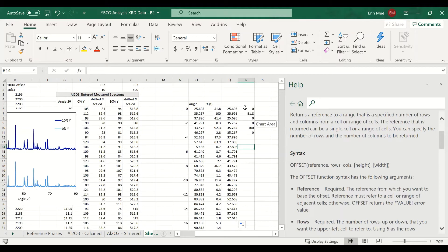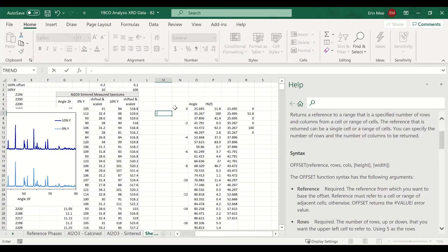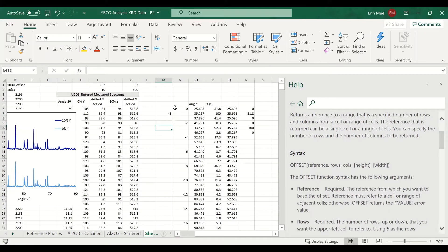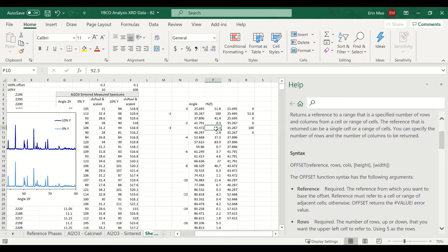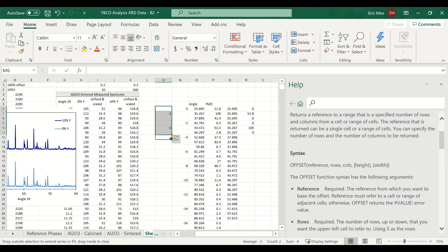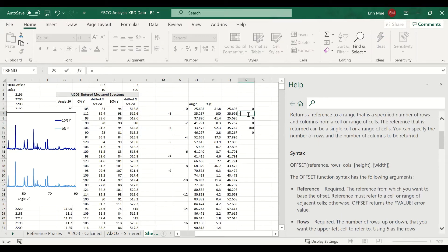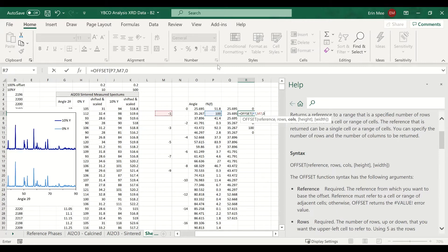For the intensity column, same issue — we use OFFSET again, referencing the intensity data. For this cell we need to go up negative one row. Going down the pattern, it's negative three, and for the next group, we reference this cell and go up one, two, three rows. This can also be copied down the same way. So OFFSET references the cell, uses this number of rows, and zero columns.